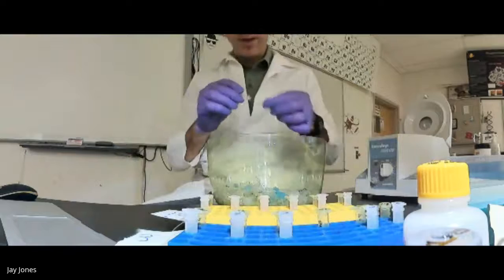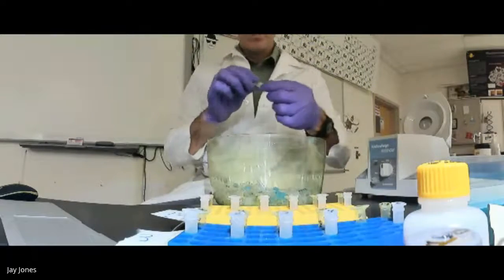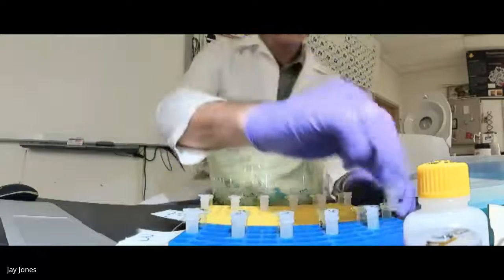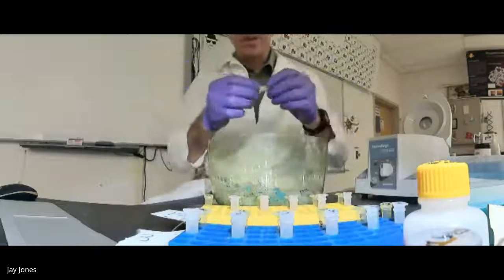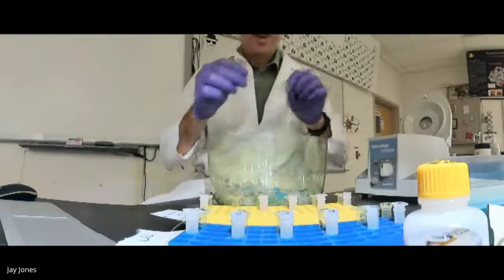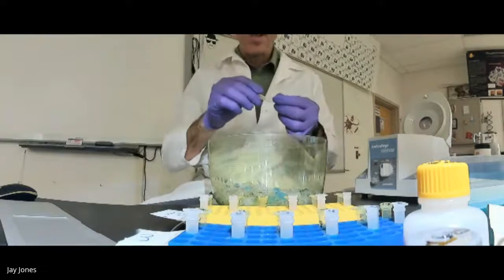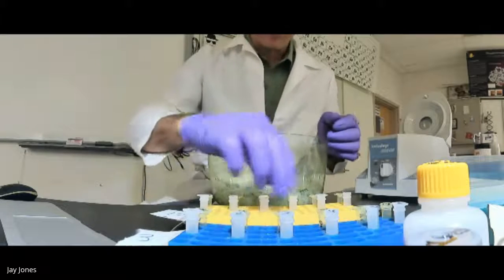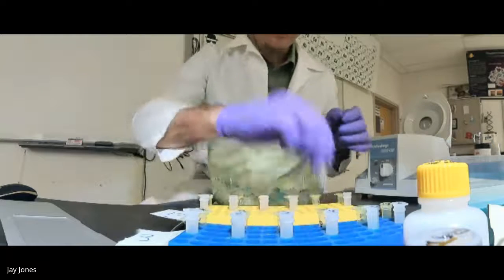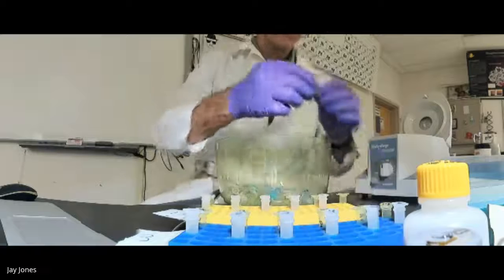And I'm happy because the liquid went through. That means that there's a flow through these columns. That means the column's doing what it should be doing. As long as there was DNA in that supernatant, the column will grab it. And the fact that I see liquid flowed through the column upon the centrifugation tells me that the column probably grabbed the plasmid. That's what I'm hoping for.